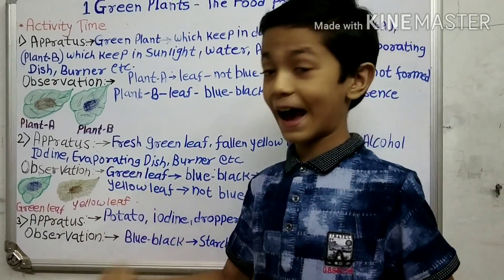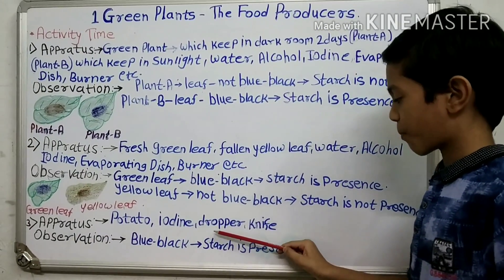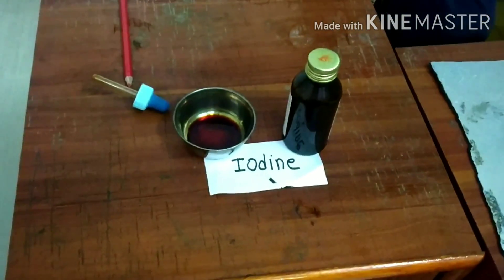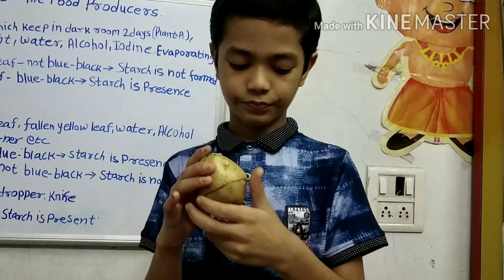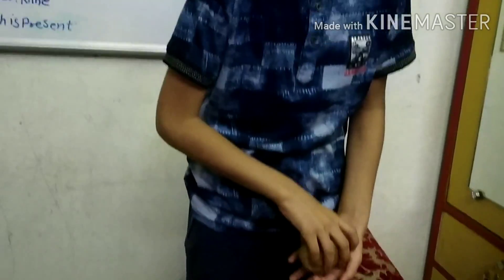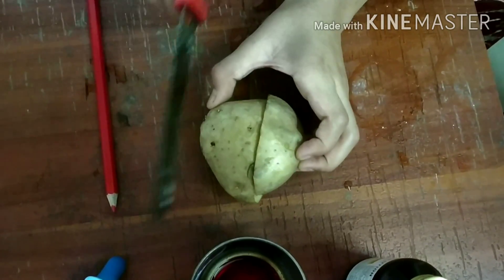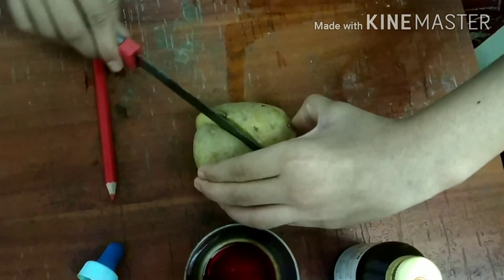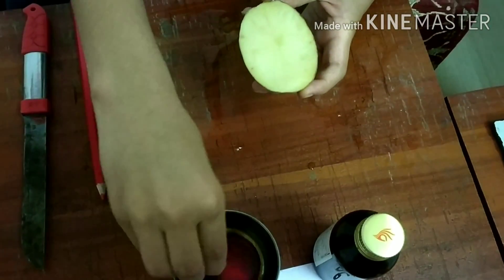Now this is the last, the third activity. To do this activity we will need a potato, iodine, a dropper, and a knife. Here is the potato, the iodine, and the dropper. Now we will cut the potato — be careful while cutting, we have to cut the potato and not our fingers. Now let's put some drops of iodine on the potato.